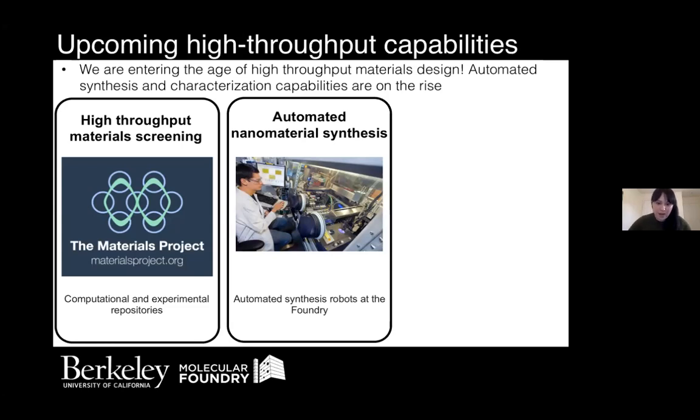So this robot that is named Wanda, that is developed and run by Dr. Emory Chan in the Inorganic Nanomaterials facility, can actually make a library of nanomaterials or nanoparticles for you, varying composition, reaction time, or reaction temperature, whatever synthetic variable you want to control.